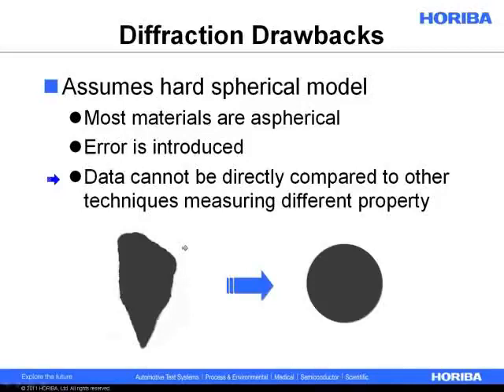Again, not an equivalent spherical diameter. So it's just important to understand the trade-offs. We assume that it's a hard sphere in order to solve the equations. Some vendors will say that they can solve for irregularly shaped particles. That's a bit of marketing spin.